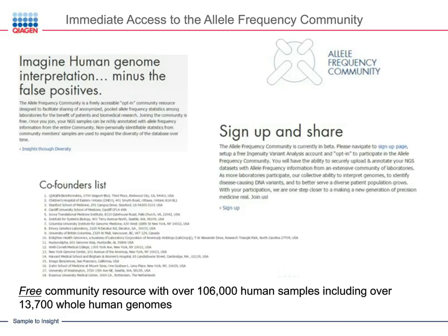And so using the allele frequency community, which is something we've set up, allows people to donate their genome sequences to calculate allele frequencies to know the prevalence of a particular mutation within a certain population. This is a free service to all users, and it really has the power to reduce the noise in the data, where you can start generating error models and removing the noise from the signal.